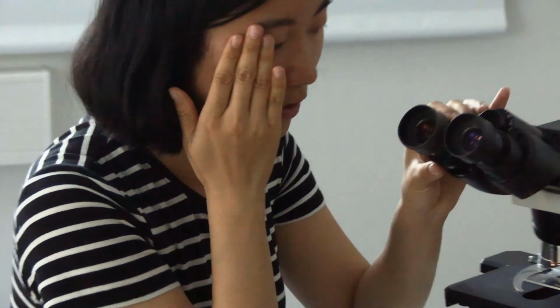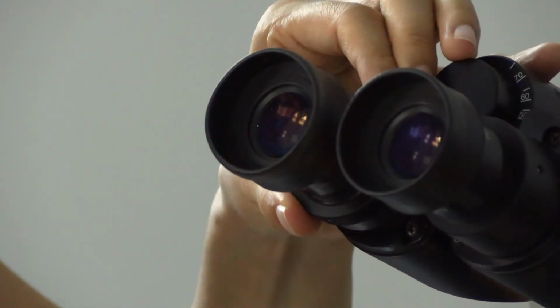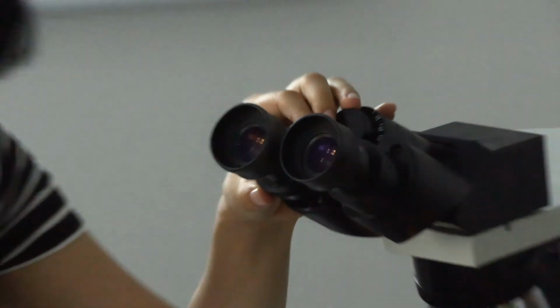Then you need to adjust: close one of your eyes and focus here, then close the other one and open the first, look through and focus for each. And at last, try to focus on both. Turn a little bit here, but not too much. When you have problems, just ask one of the TAs or the teachers.